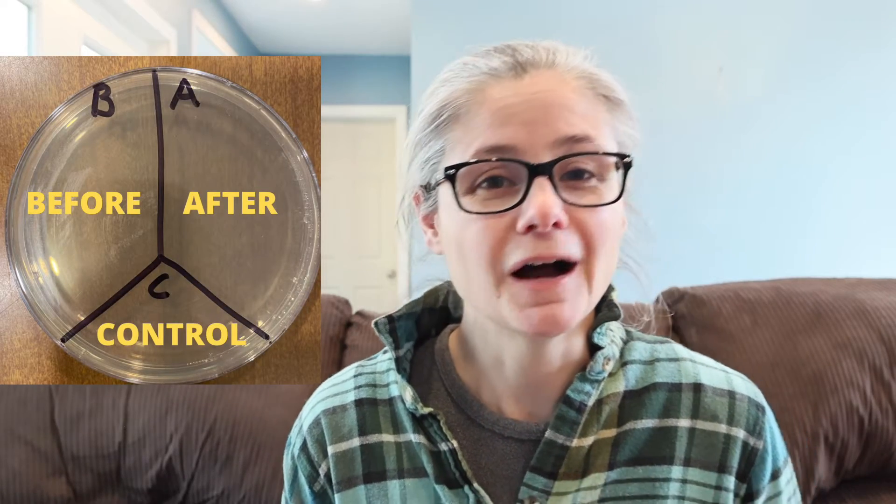In order to test how well it does remove bacteria around my home, I'm going to take a petri dish just like this one and label it A, B, and C. I'm going to take some sterile swabs and swab various areas around my home, including the kitchen sink, kitchen sink drain, bathroom sink, and toilet rim, and place those samples in the section labeled B for before.